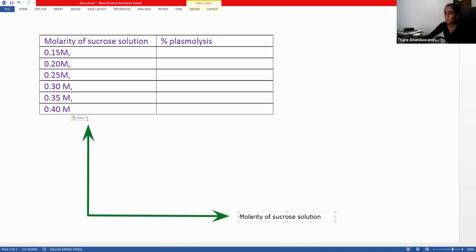And to this side, I'm taking percentage plasmolysis.